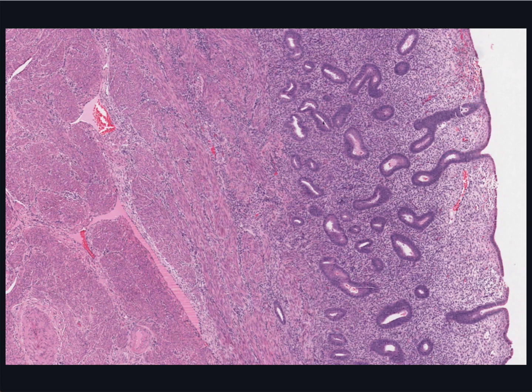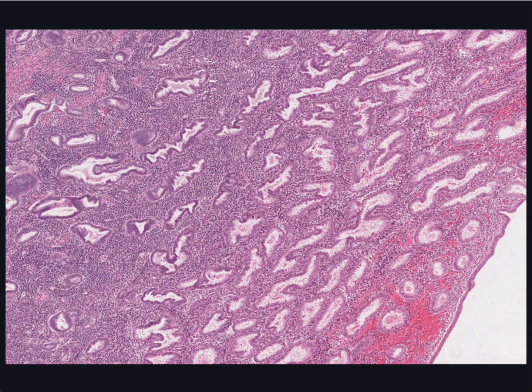This section demonstrates the uterine endometrium in the middle of the secretory or progesterone phase. Notice its lacy appearance due to the development of the glands. These glands are actively secreting mucus and much of it remains inside the glands, enlarging them. The glands are very tortuous rather than generally straight as you saw previously.